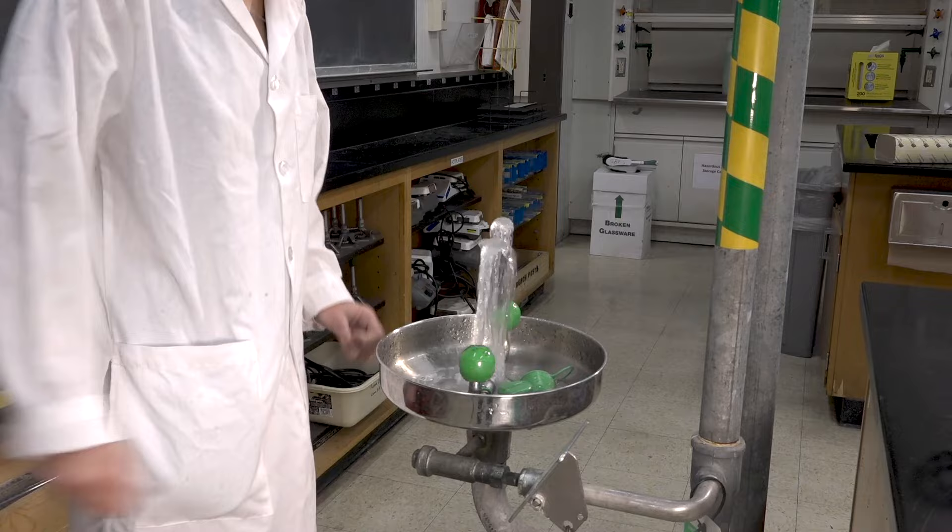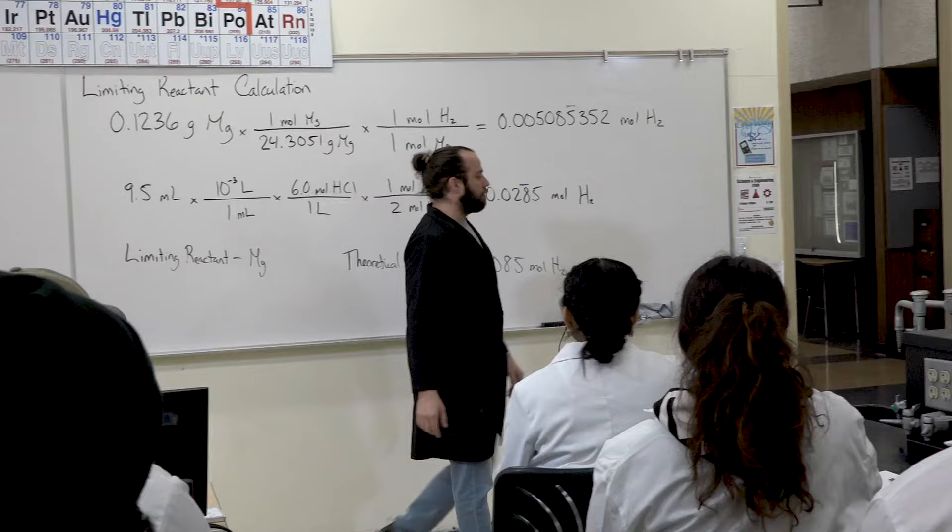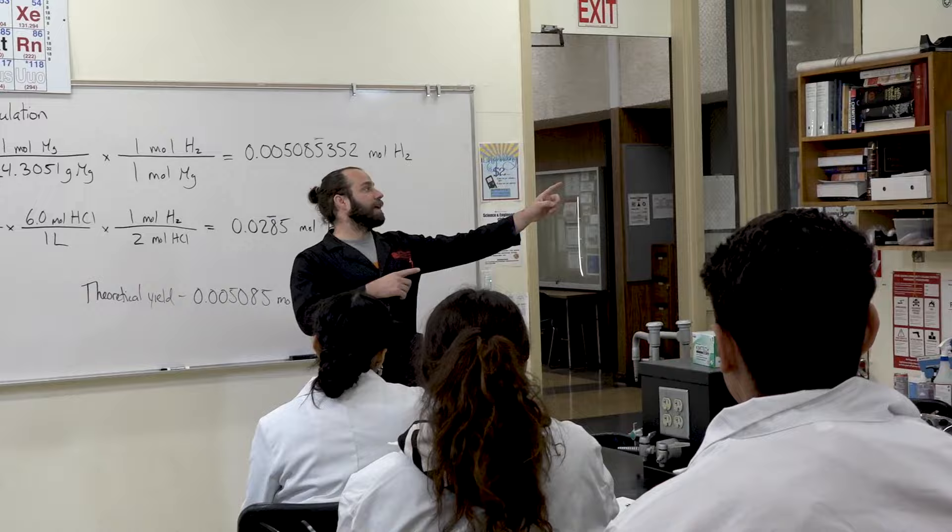Chemistry labs utilize open flames and dangerous chemicals in many experiments. Knowing the location of the safety equipment in your room is important to mitigate the danger associated with such risky materials. Please take note as your instructor points out the specific location of equipment in your particular lab space.